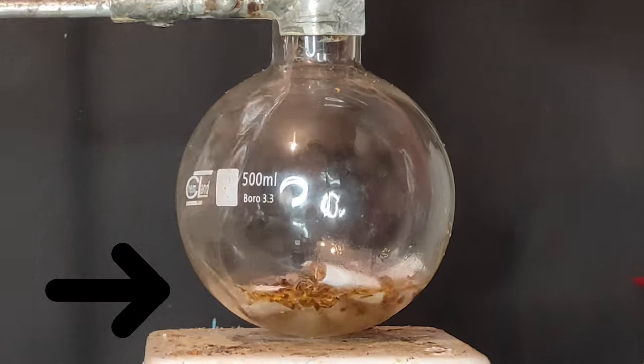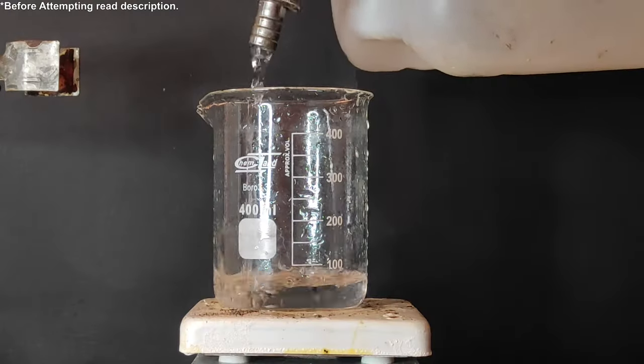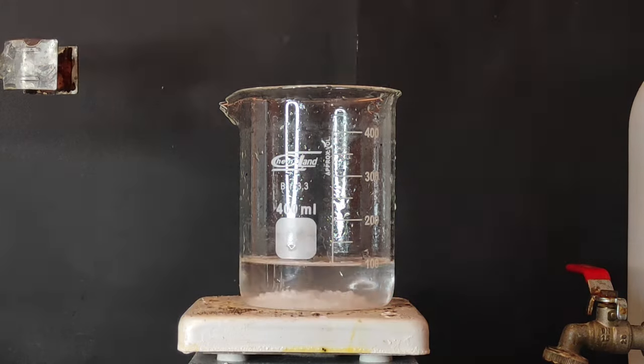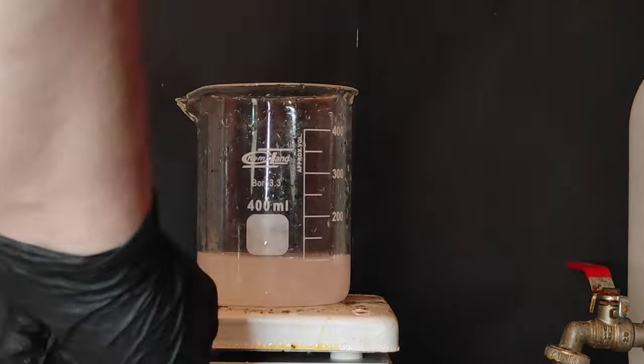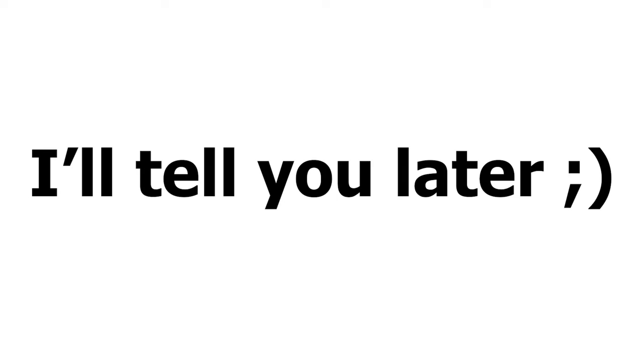This video I'll be extracting some nicotine from cigarettes. To start I've made a 10% solution of sodium hydroxide. This makes an extremely alkaline solution which will add to the cigarettes. Why, I'll tell you later.